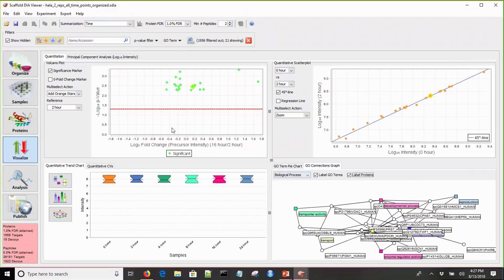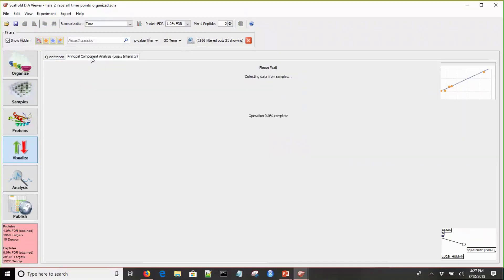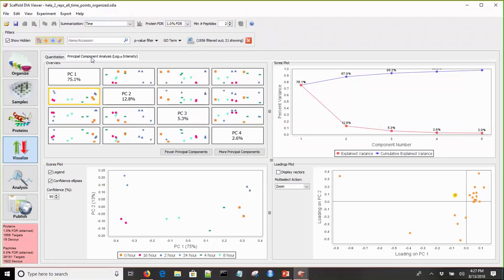The last thing I want to bring up is Scaffold DIA has principal component analysis built in. From the visualize view, we can click on the PCA tab, and we can see how all of our samples group together.